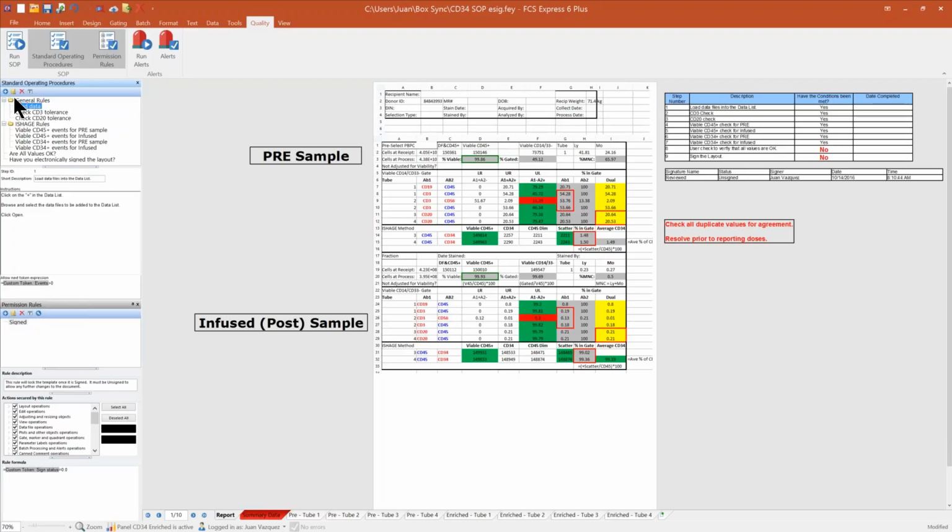Each one of these steps can be specifically created to say, step one, load my data. Then we can create a function to analyze whether or not there's actually been data loaded in each plot. If it turns out there is, then the user can move on to the next step. If not, then they have to satisfy the criteria for that step before they can move on.